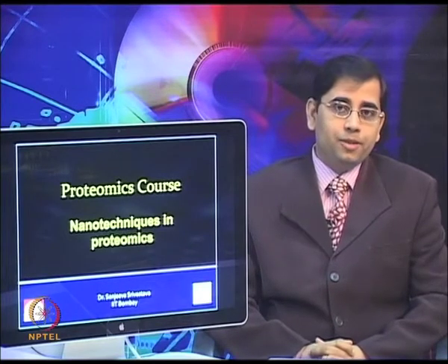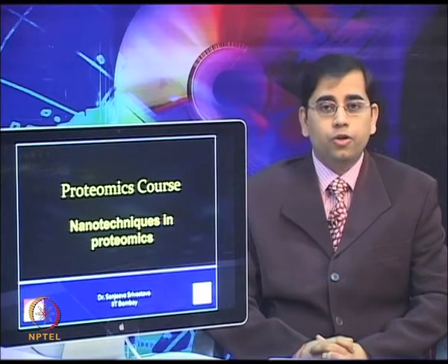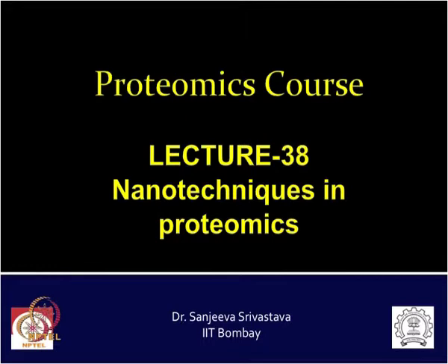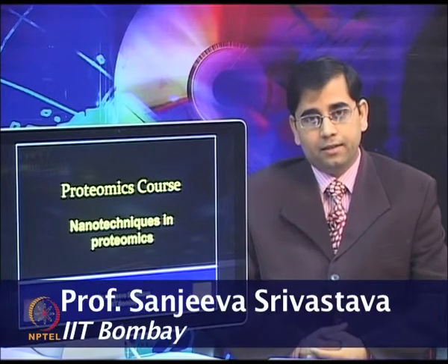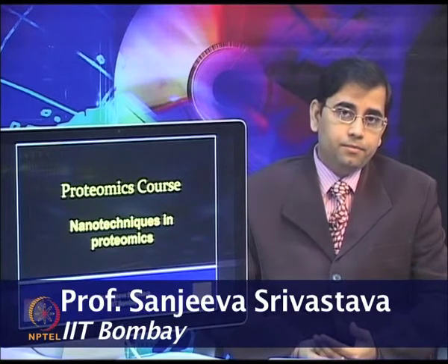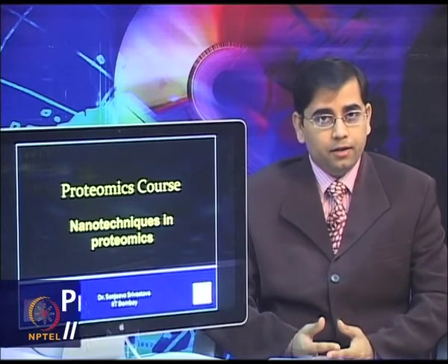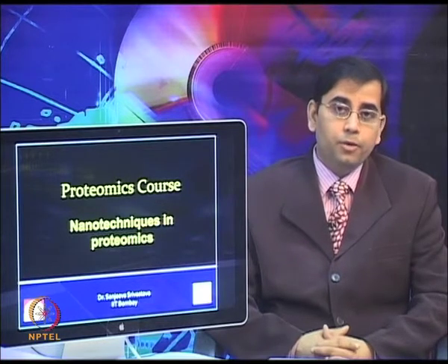Welcome to proteomics course. In today's lecture, we will talk about nanotechniques in proteomics. In the last few lectures, we talked about different types of proteomic technologies. We started with conventional gel based proteomic techniques. We moved on to mass spectrometry, different types of quantitative proteomics by using mass spectrometry.